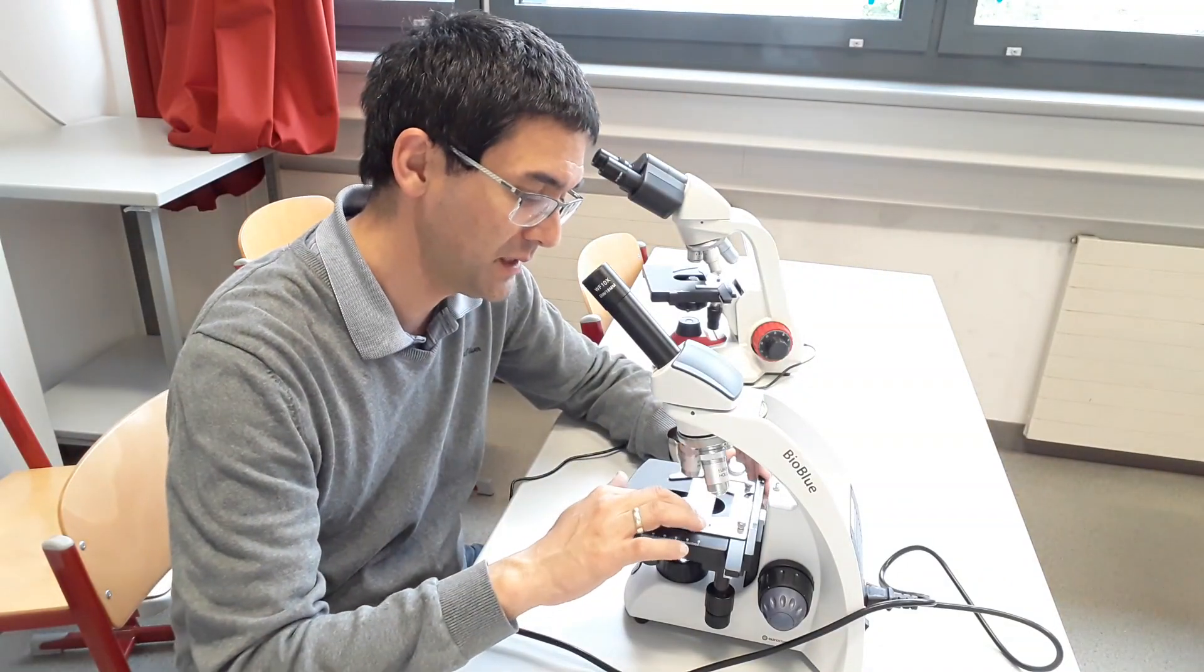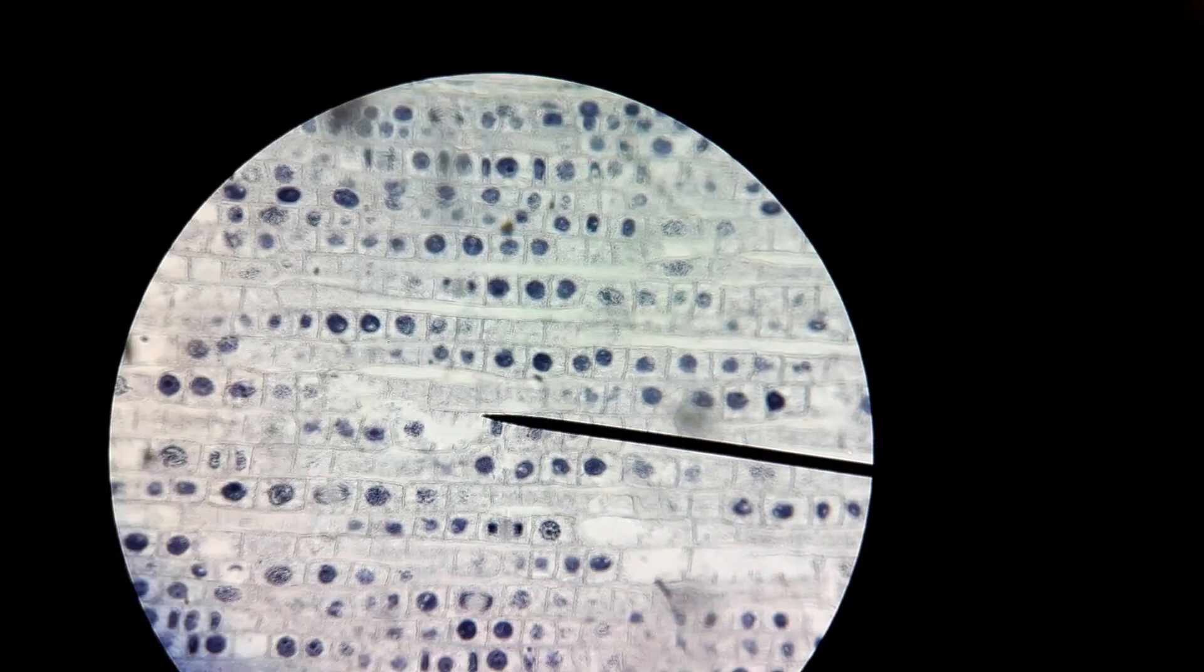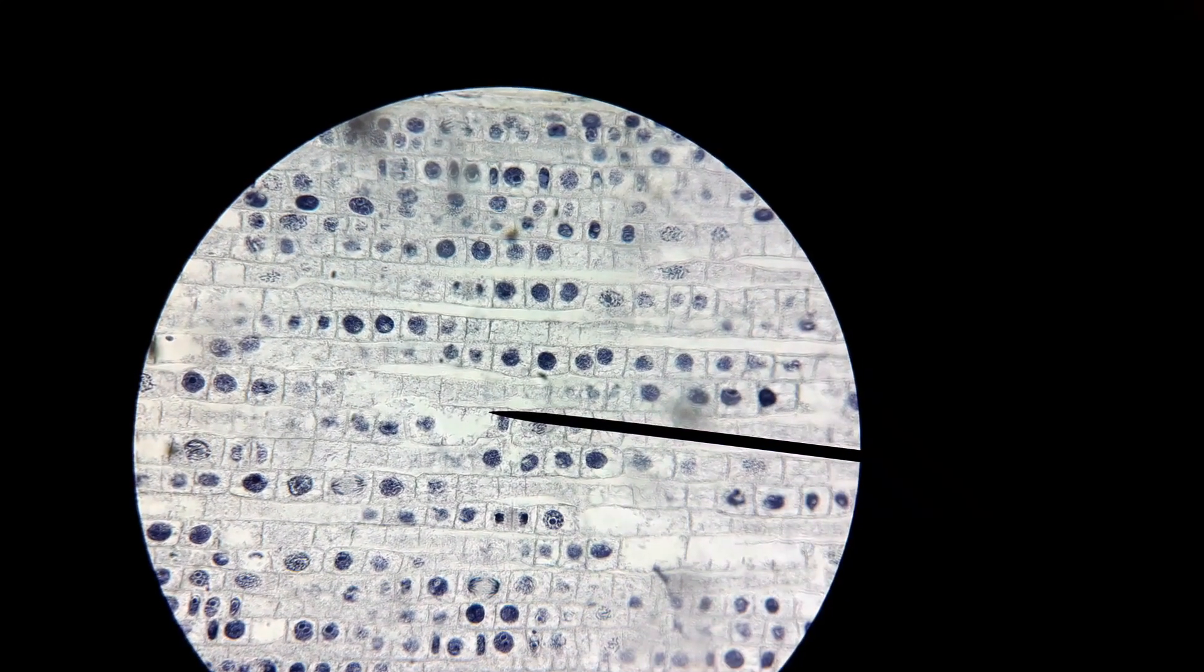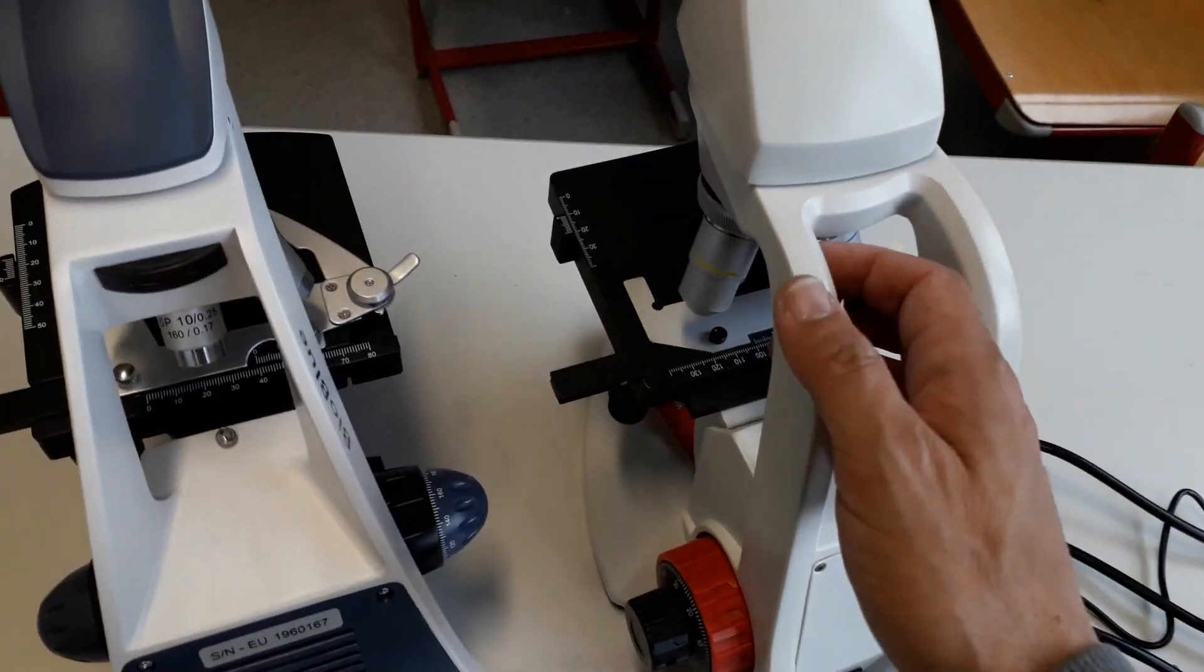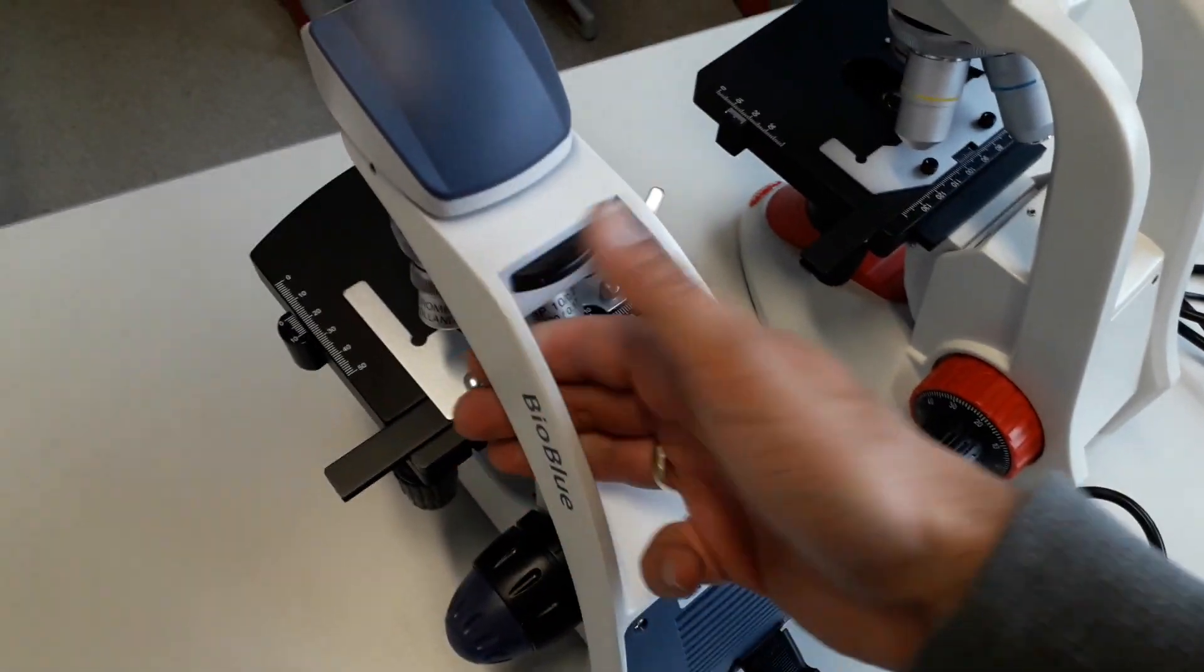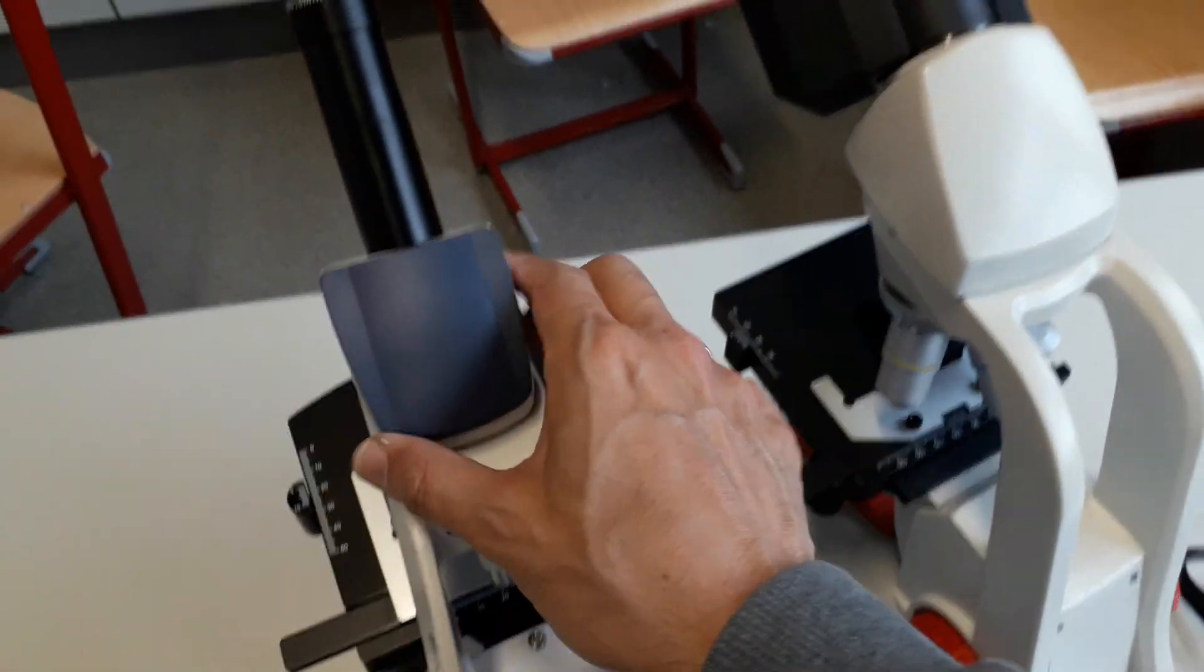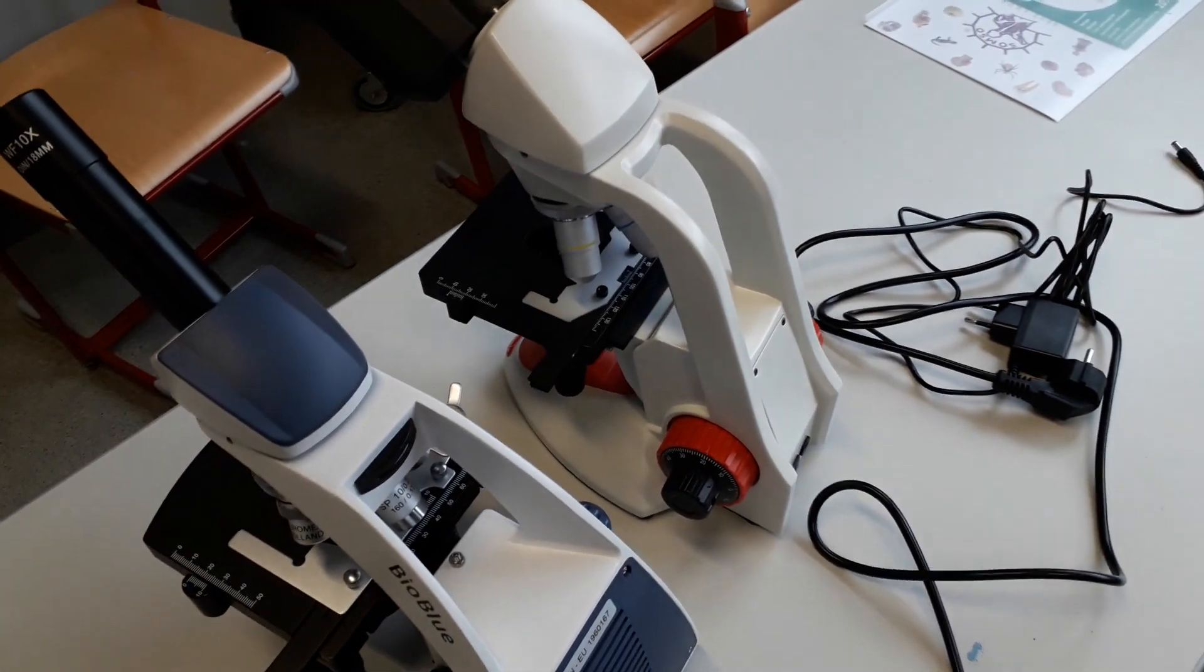Now what about the Euromax? Let's have a look at this one. You see, that's basically what you see. This black line that you see, that's an arrow. I can turn the arrow, and the other one also has this on the other eyepiece. It's a little bit difficult for me to hold it. But I think you get the idea. So that is now using the 40 times magnifying objective. So which one's now easier to carry? I could actually, that works quite well. Here it's a little bit smaller. But for children's hands, it should be okay as well. It's also possible that the microscope is a little bit lighter, but then again, only a monocular. I don't know. Pretty much equal in almost every respect.